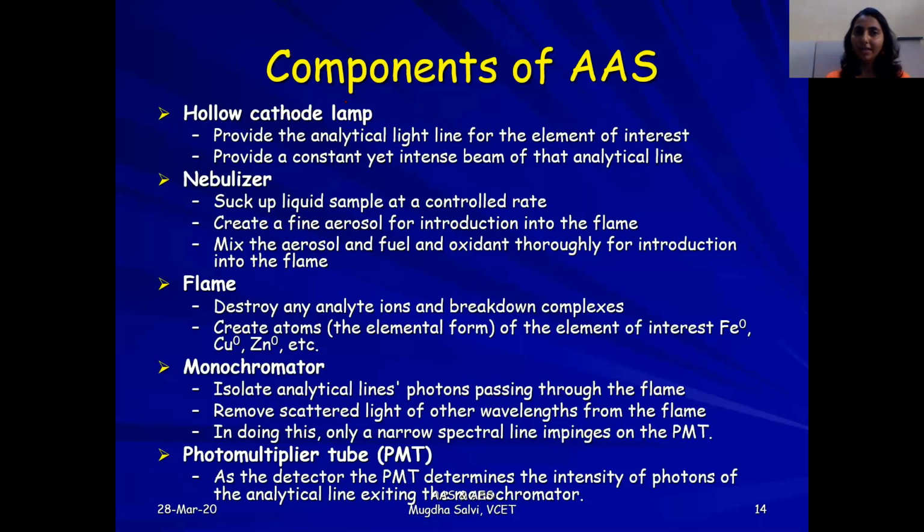Then you have the nebulizer. Now, what is the nebulizer doing? It is sucking up liquid sample at a controlled rate. Then it is creating a fine aerosol for introduction into the flame. It mixes the aerosol and the fuel and the oxidant thoroughly for introduction into the flame. We will be seeing exactly what a nebulizer is made up of just in some time. Then the flame, it basically will destroy the analyte ions and break down the complexes.